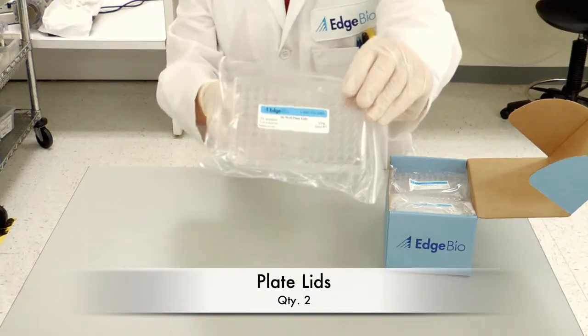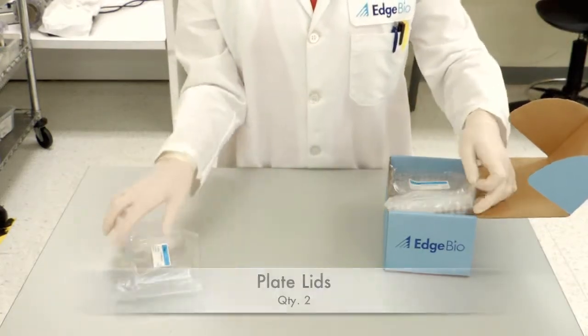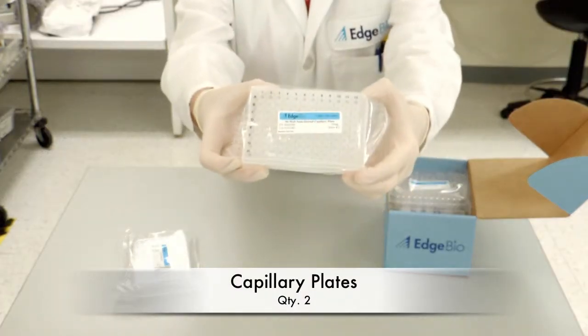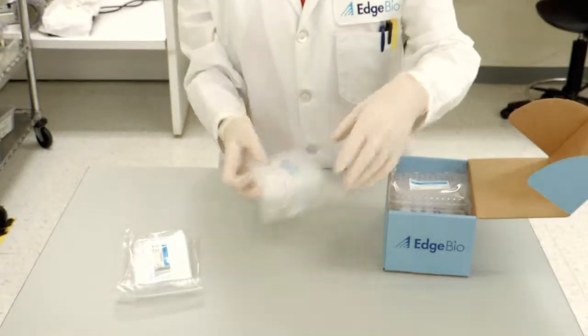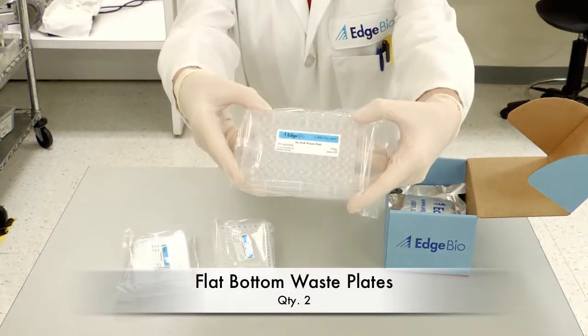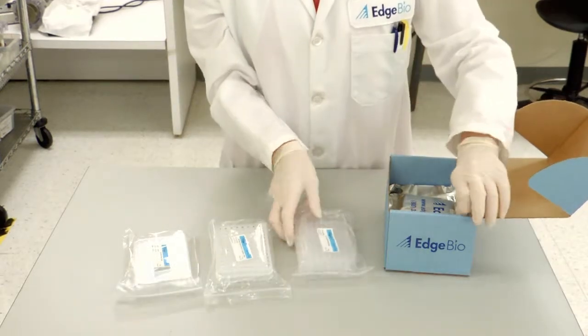Within the kit, you will find plate lids, capillary plates which serve as a receiver for the purified sample during the second spin, and flat bottom waste plates which are used to catch water eluate during the first spin.